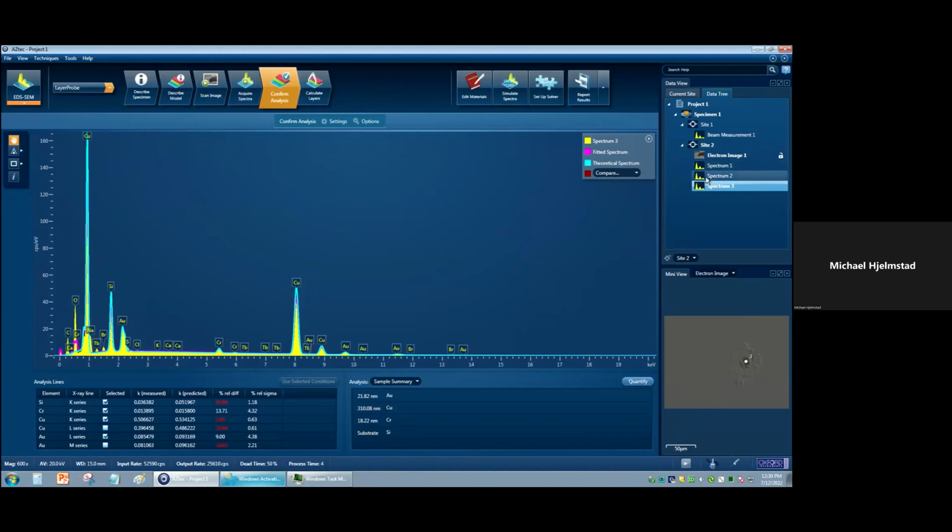Here's the trick for everybody. I went back to the person that grew this and just went, there's no way you have 30 nanometers of copper. And they looked at me incredulously and said, no, who said 30 nanometers of copper? I said, well, that's what the label says, 30, 30, 30. And he goes, look at it again, it says 30, 330.